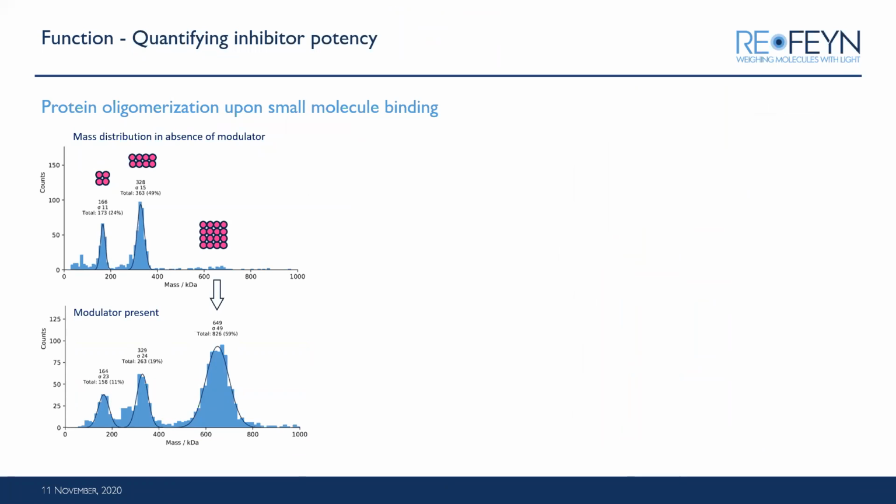Now, all I told you until now are interactions of proteins with other proteins. For a lot of applications, there's a need for quantification of small molecule binding.